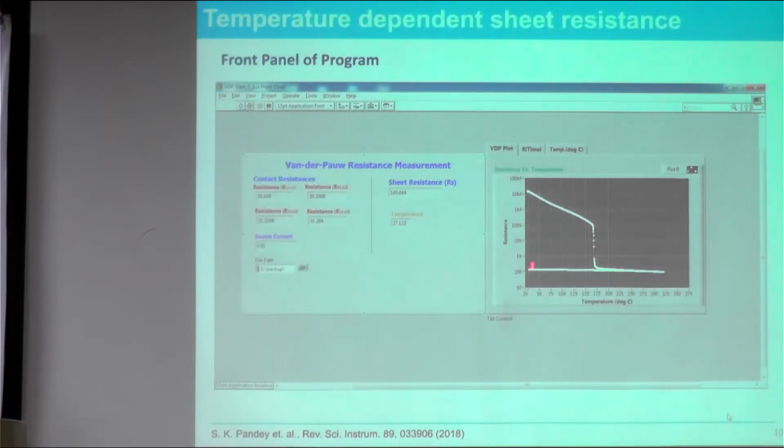So we can identify this resistance contrast first with this. Another thing is that we can see the crystallization temperature with this. So using this measurement, you can directly calibrate your material first of all, because crystallization temperature is very important.